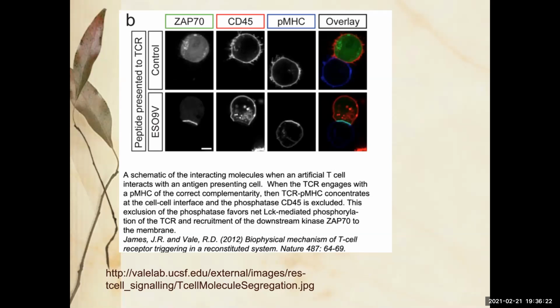And this is the image you will generally see. This image is full of info because this is one set of cells, and this is another set of cells. And what they're showing here, let's just look at the overlay in this paper, is that in this scenario, these two cells are different. I can tell a green-red cell from a blue cell, and they've got different functions in the immune system. You can read the label below and ask me more about it. But these two cells are doing two very different things. One's a T cell, one's an antigen presenting cell.